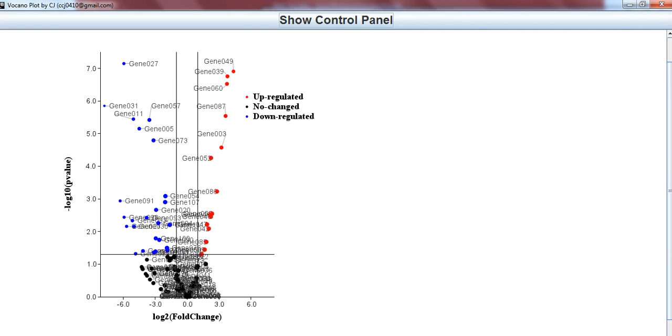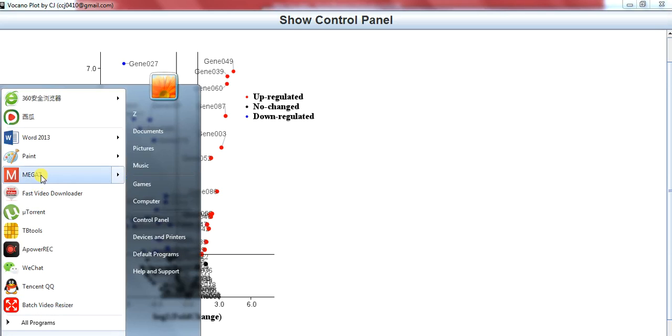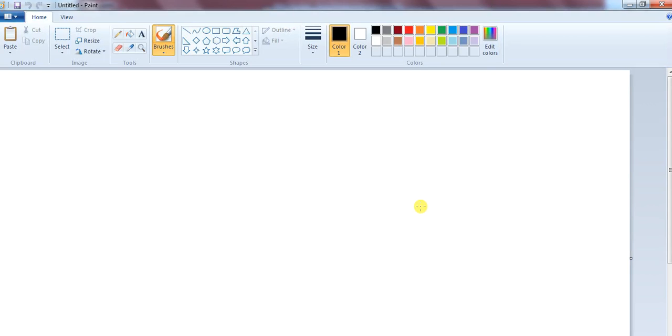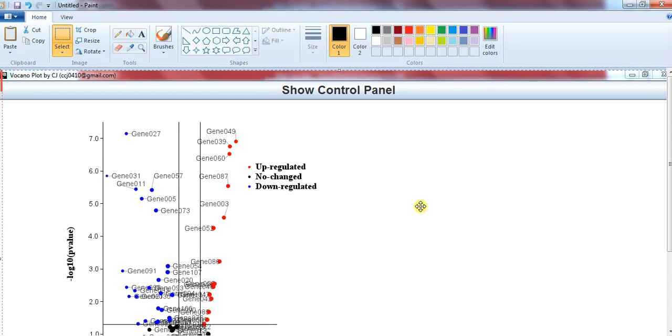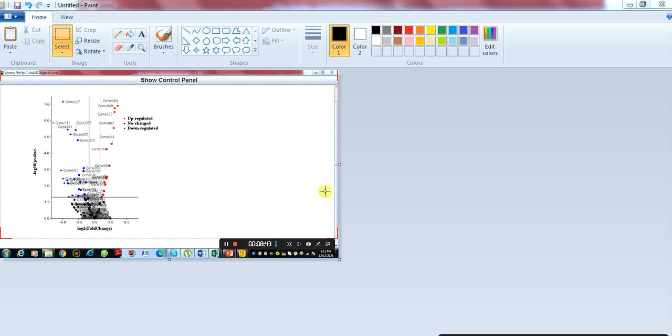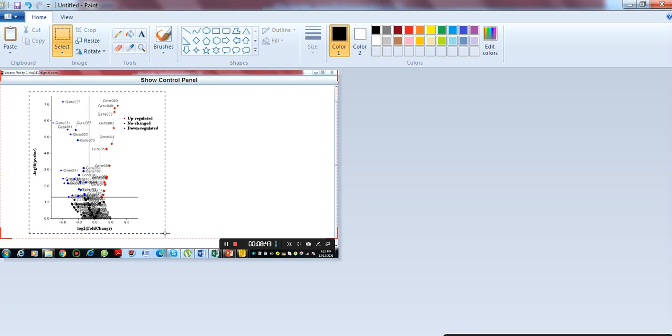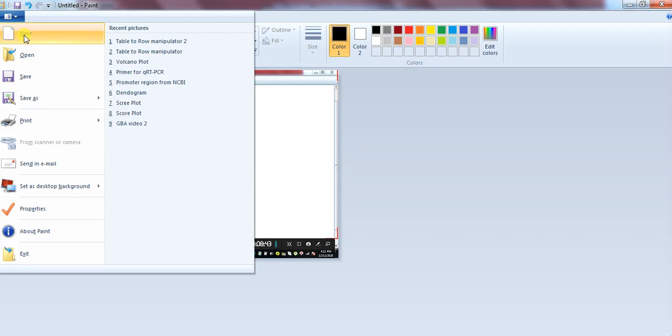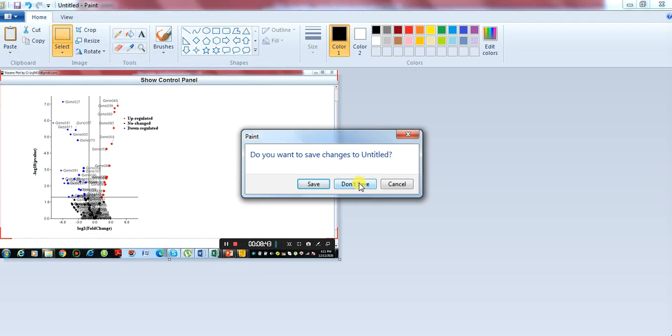So now for saving it, you need to make the print screen. Press the print screen button of your keyboard and open paint and paste it or control V from your keyboard. Now crop it from here.